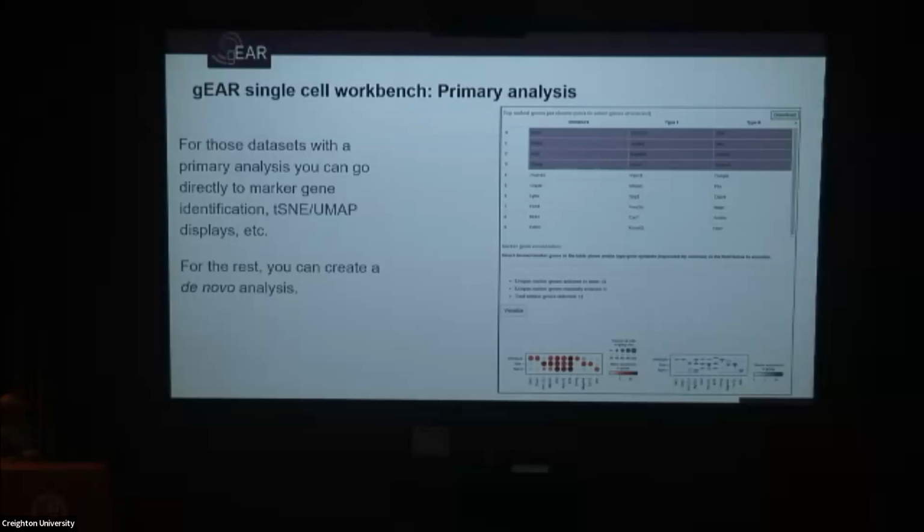So if I choose it to show me the top 10 marker genes in each one, you get that automatically. You can then click all the ones you're interested in or type in additional ones to visualize those markers. And this is pretty quick. Almost all this, from loading the data set to doing this step, is usually just 2 or 3 minutes or less.